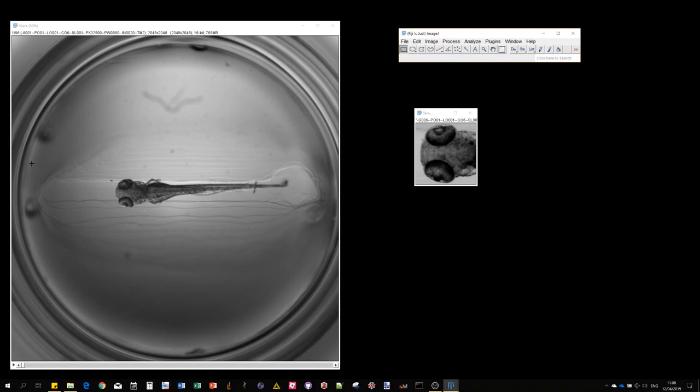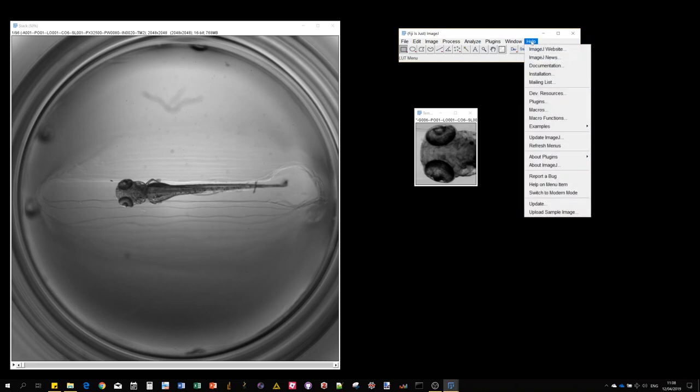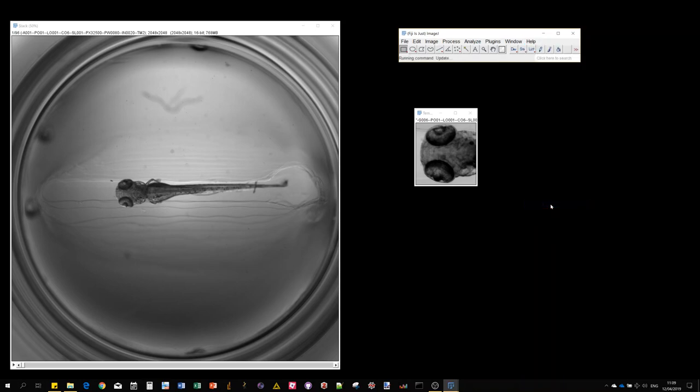The larvae are sitting in a 96 well plate for detection of the head. The first thing I want to show you is how to install this plugin.